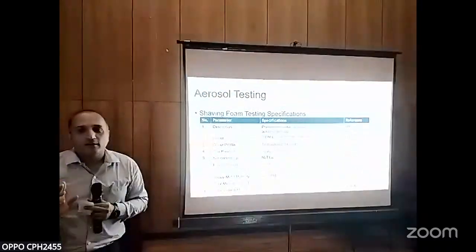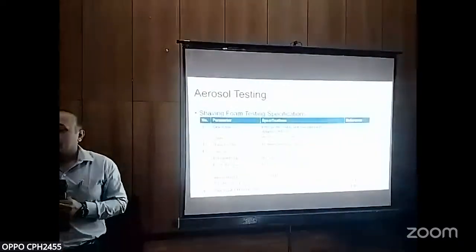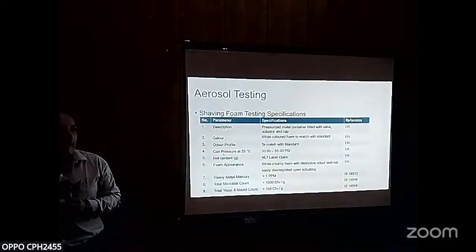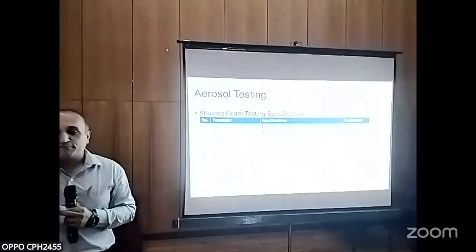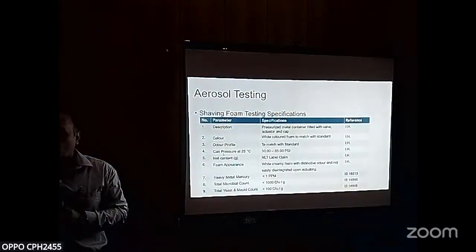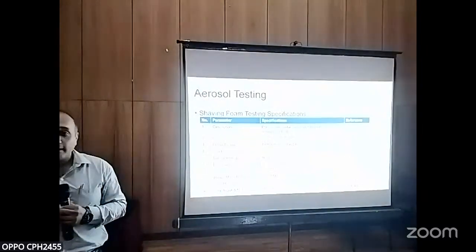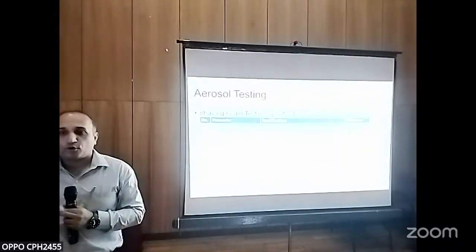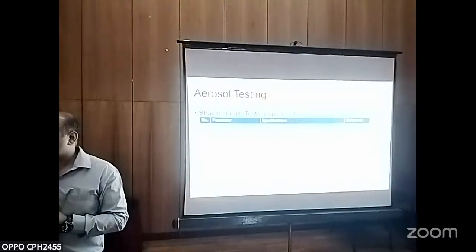One of the very critical parameters which has to be considered in aerosol container testing is the can pressure. Can pressure gives the analysis of what quantity of propellant is present and whether that pressure is sufficient to dispense the entire product out of the container.